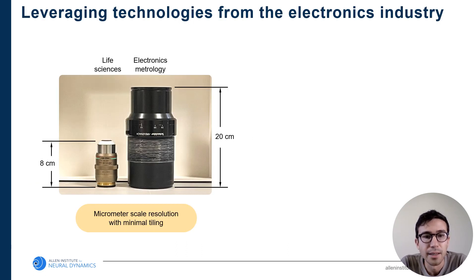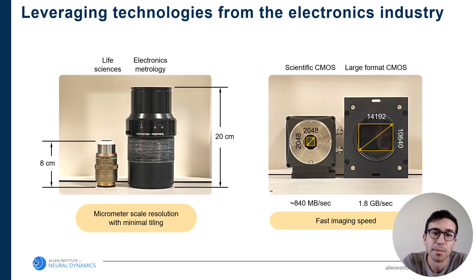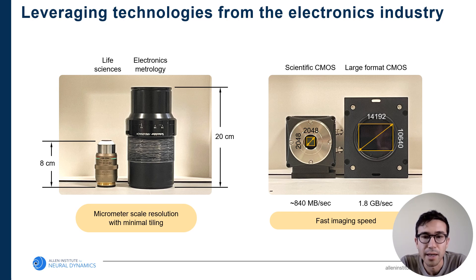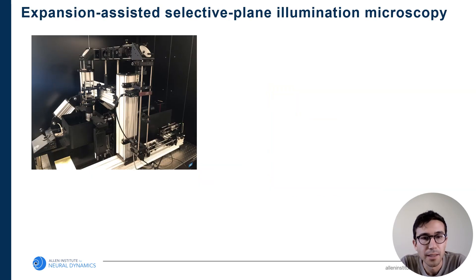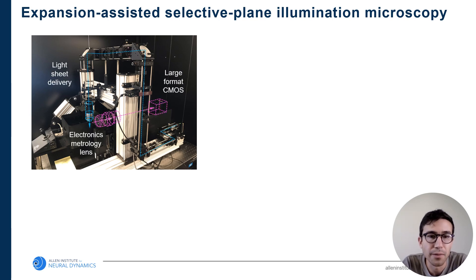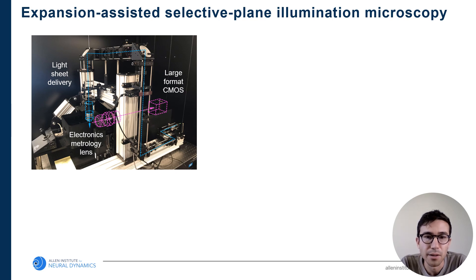Looking at these in the lab: on the left, I'm showing arguably one of the largest life science objectives, but it's actually dwarfed by one of these electronics metrology lenses we've purchased and are using in our new systems. Similarly with the camera, scientific CMOS cameras with about four megapixels have been the standard in light sheet microscopy for a while, but there are large format CMOS sensors available in the metrology space that have, for example, 151 megapixels. These large format CMOS sensors can actually go even faster than scientific CMOS sensors in terms of pixels per second captured.